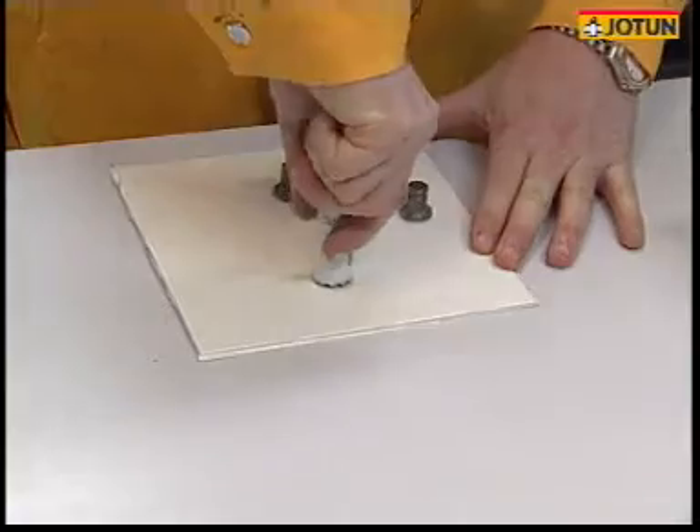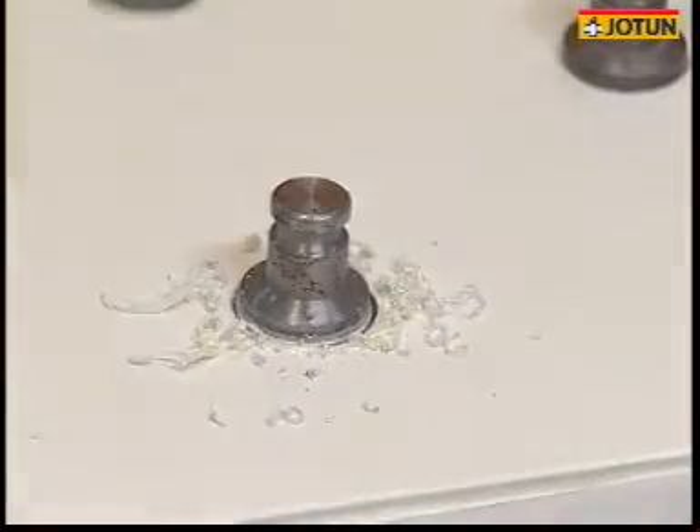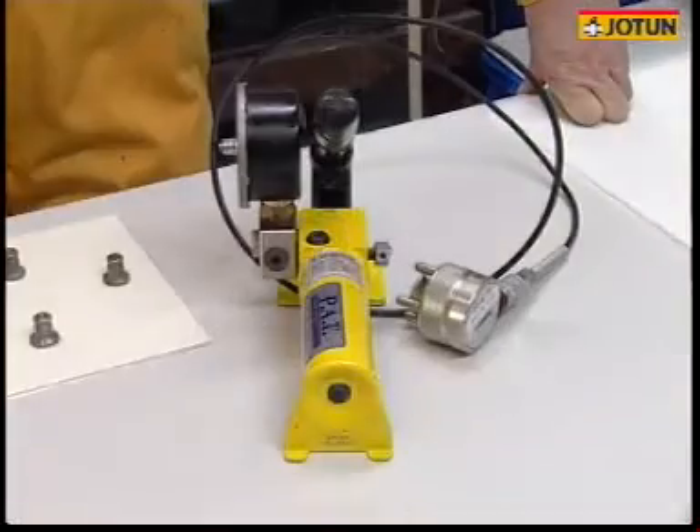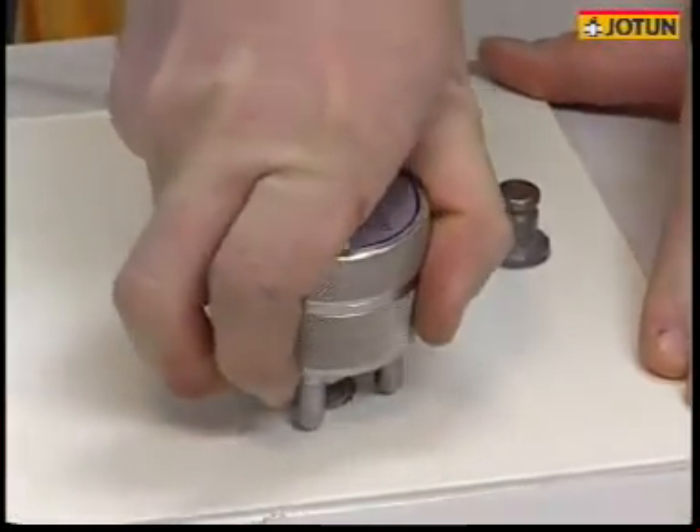Using the special tool, cut around the dolly, making sure to penetrate right through the paint down to the substrate. Check that the calibration certificate for the equipment is valid and fix the grip around the neck of the dolly.